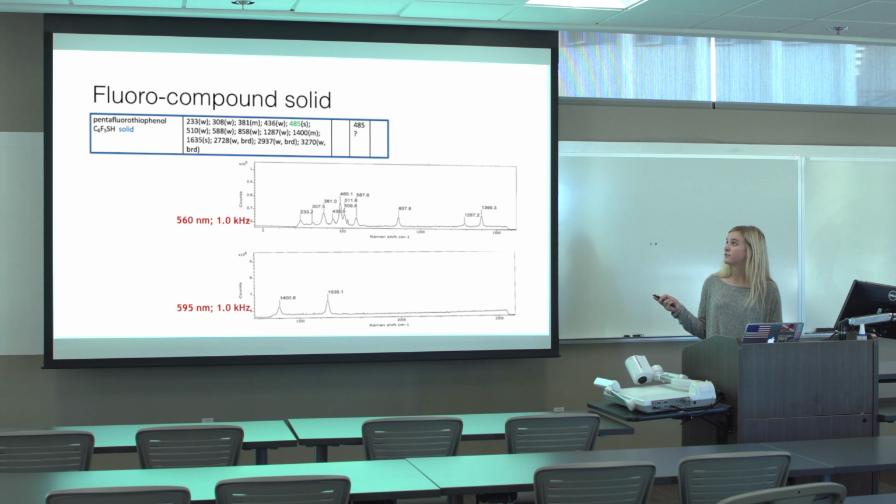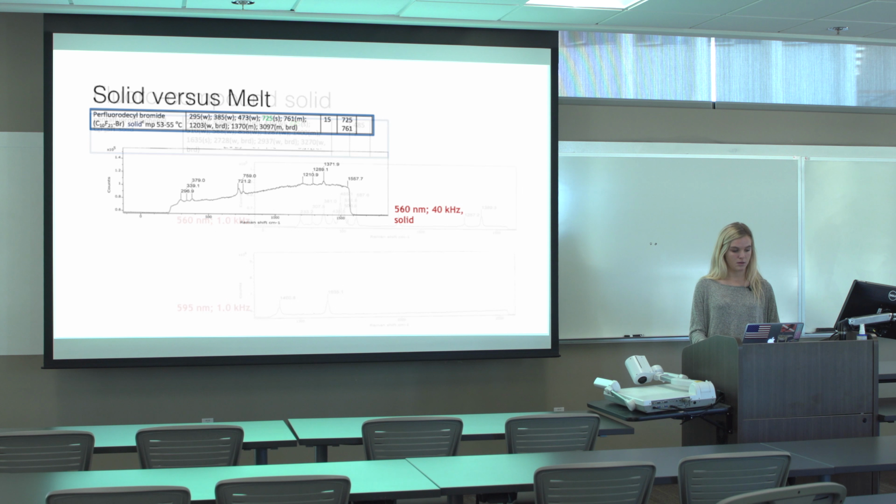We've also then moved on to fluorocompound solids, and this is pentafluorothiophenol. As you can see, this is at 1 kilohertz, and we're still retrieving sharp, clear data. I would also like to point out that with our laser, this is possible without the expensive extra attachments that regular Raman lasers do require.